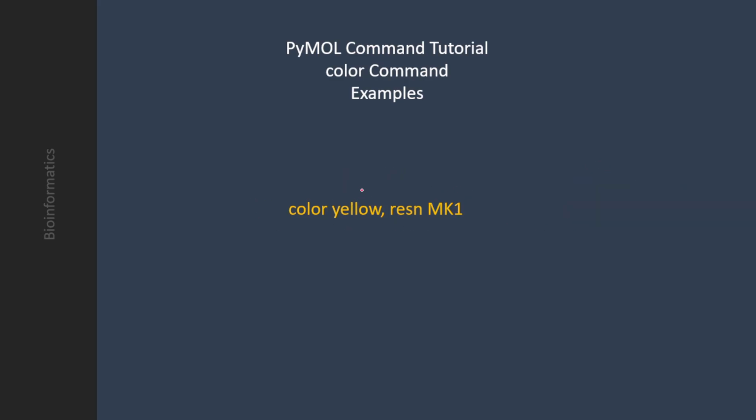Next is if you want to make it yellow. As you can see over here, we are creating this in yellow color. And again, this is something that PyMOL will understand, and this is yellow. This is the color. What is next?